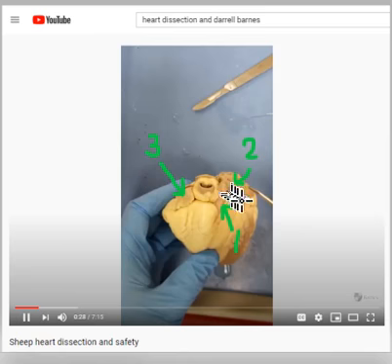So what is this little ear looking thing hanging off to? And then likewise, what is number three? There will be a link in the comments below to a blog where you will be able to retrieve the answers as I perceive them.